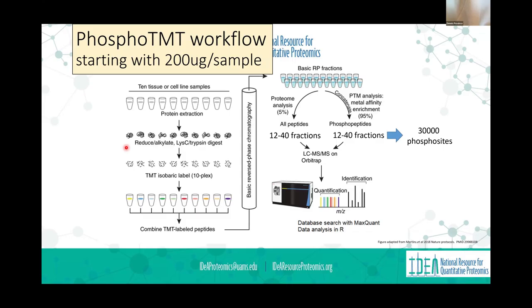If we do phosphoanalysis, we ask for 200 micrograms, and we're loading all of that on the mass spectrometer. And so we're asking you for twice as much, but we're using 200 times as much. And so that shows you the role of enrichment. We actually take 95% of that sample and dedicate it to phospho. We're doing the lysate with only 5%. And with that, we do the enrichment, and then we fractionate and let the mass spectrometer pull it out.